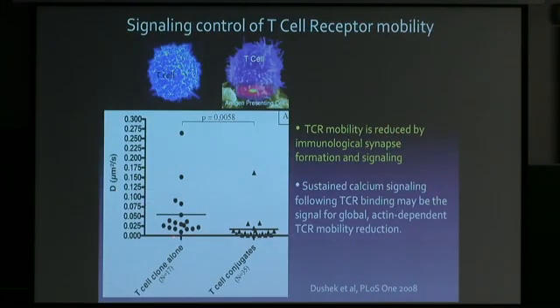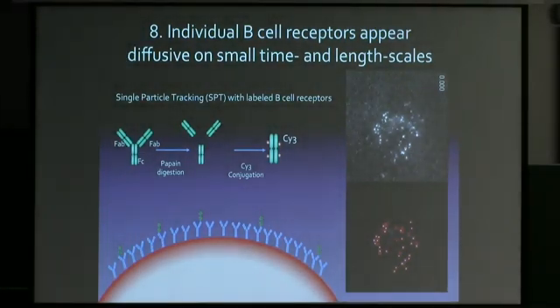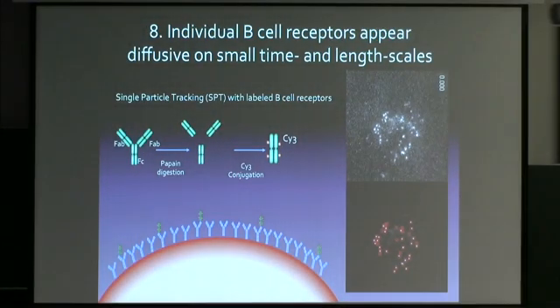You can also look at how a natural signaling, rather than drug-induced signaling, would affect things, and we can see that there's generally a bit of a reduction in the diffusion coefficient from our PDE fit between the T cell clone by itself and the T cells when it's conjugated with another cell which is providing kind of natural signaling to it. Okay, and just to follow up on that, diffusion wasn't bad back then, and it's still not terrible right now.